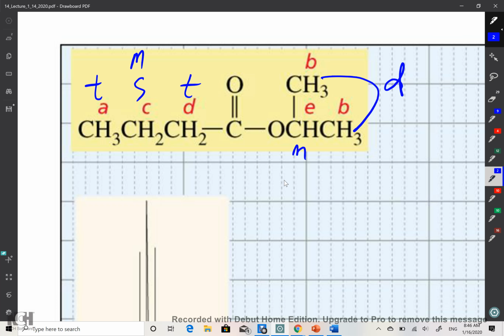Yes. So for E, you say that it's a multiplet, but since they're the same, why would you count them differently, although they are chemically equivalent? Okay, so that's why E will have 6 neighbors. And so that gives us 6 plus 1 peaks. Does that make sense? Are we good, guys?